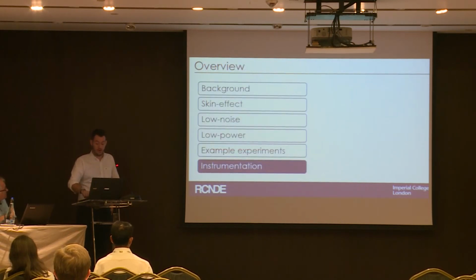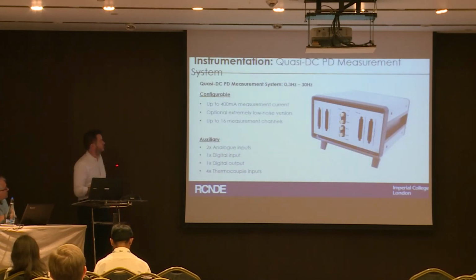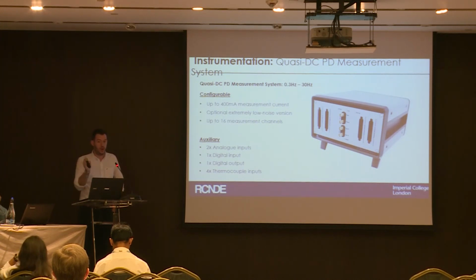Finally, how we are doing these measurements. Sorry again for the font. It is usually considered extremely difficult to take these extremely low frequency measurements. Usually on commercial equipment, you'll find that it will only go down to, if you're lucky, 10 hertz, whereas we're going down to a fraction of a hertz.